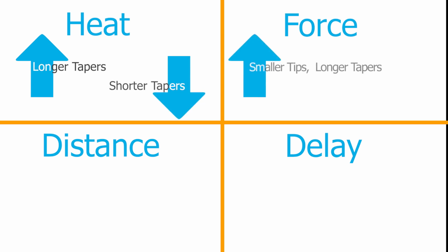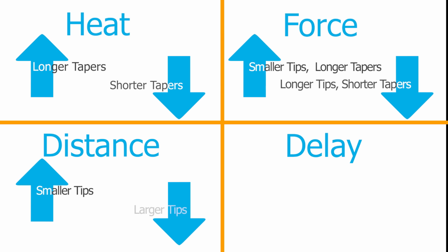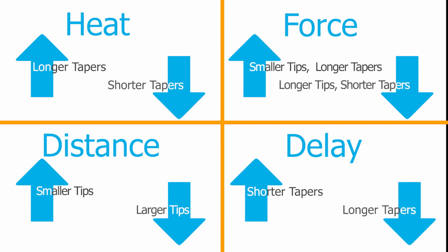Increase the force for smaller tips and longer tapers, or decrease it for larger tips and shorter tapers. Increase the distance for smaller tips and decrease it for larger tips. Increase the delay for shorter tapers or decrease it for longer tapers.